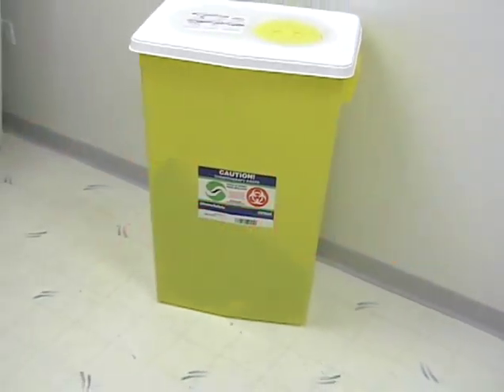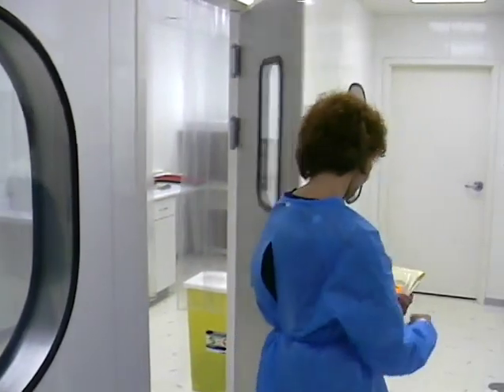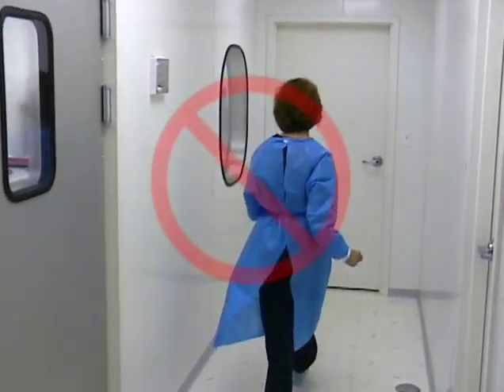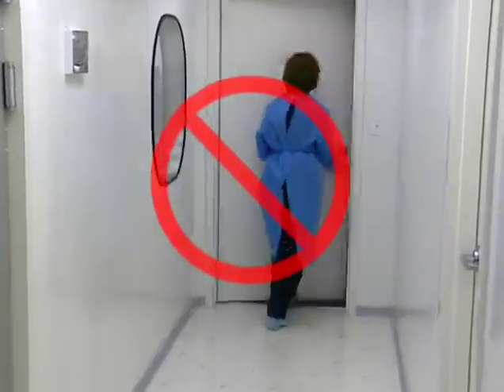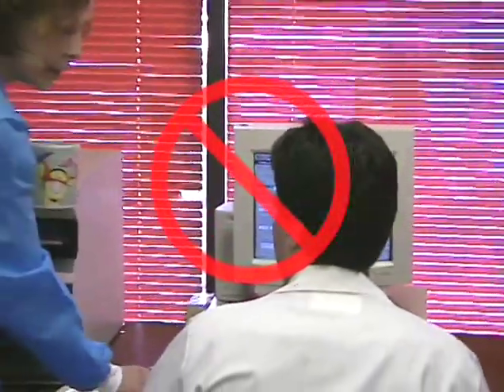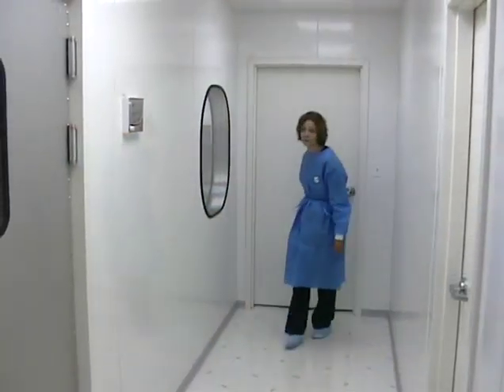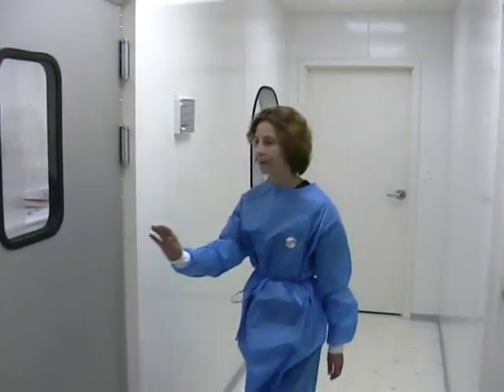All gowns, lab coats, and other barrier items should be clean and should not be worn outside the compounding area. This will eliminate the potential for transfer of drug residues to the institutional environment and prevent environmental contamination of barriers, which may, in turn, be introduced into the buffer zone and critical aseptic core.